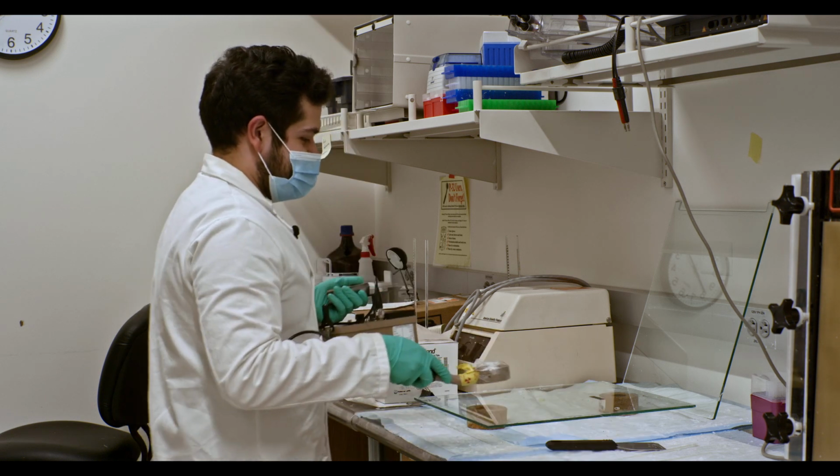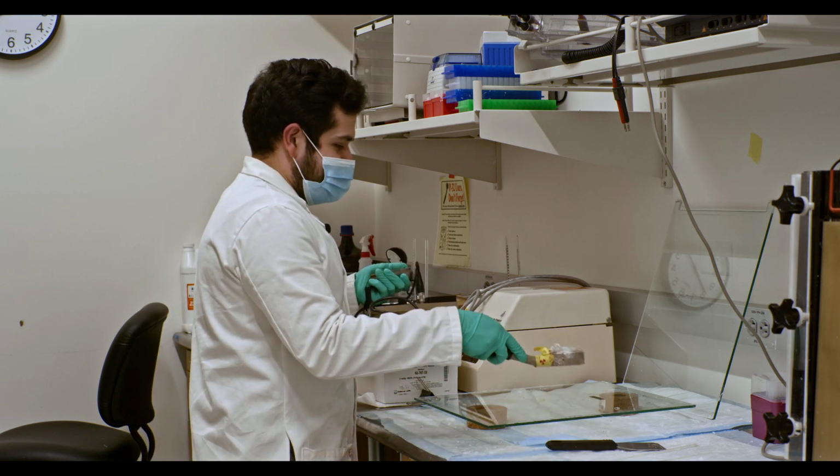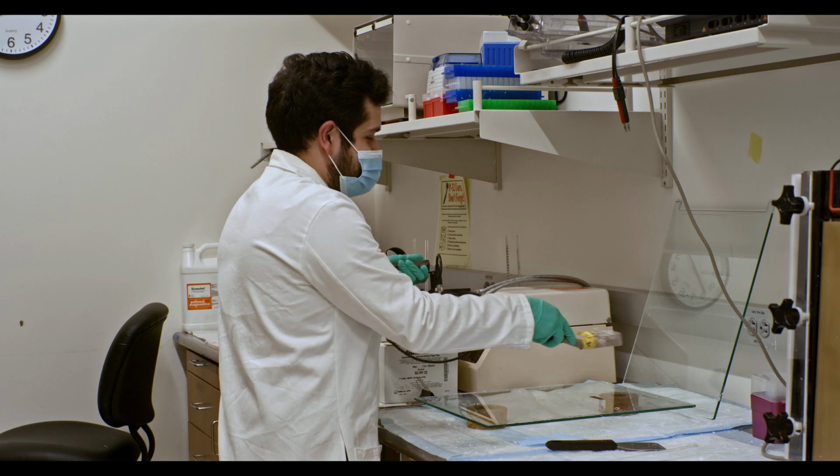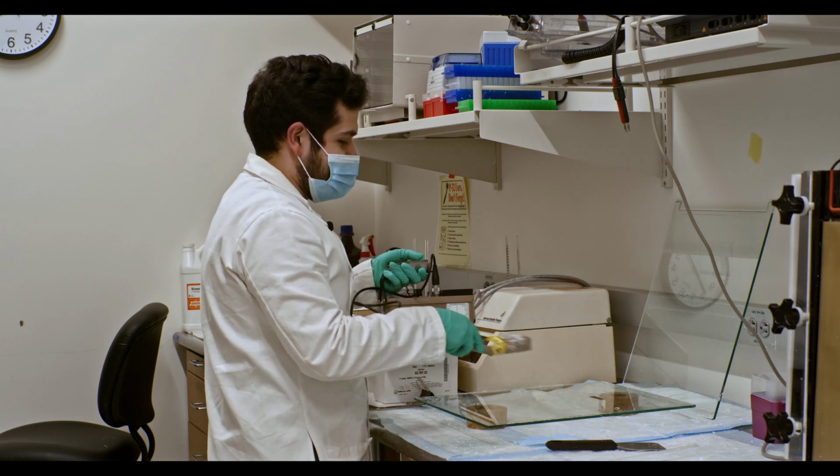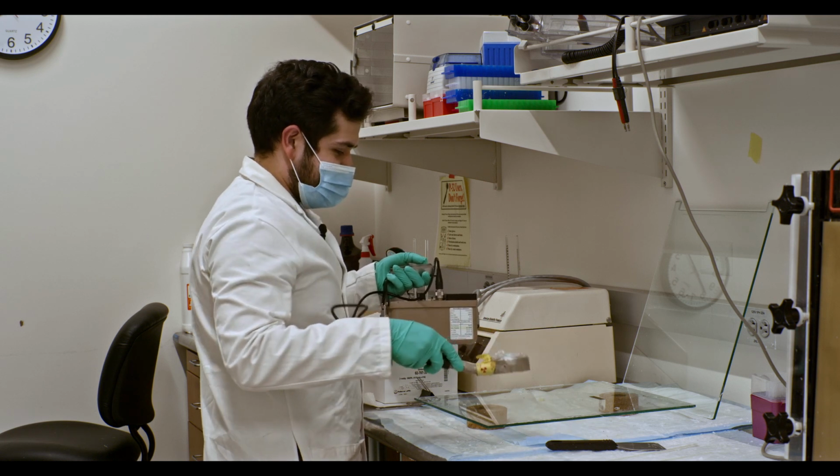As you scan the top of the gel, just a few inches off the top, you can hear that there's a tiny chirp, but there's none of this. So in other words, you have successfully taken off any sort of radioactive material that can be found on this glass plate.